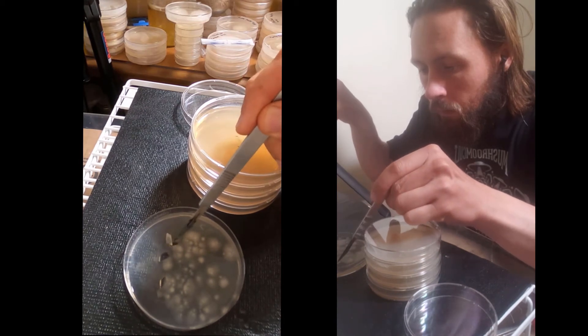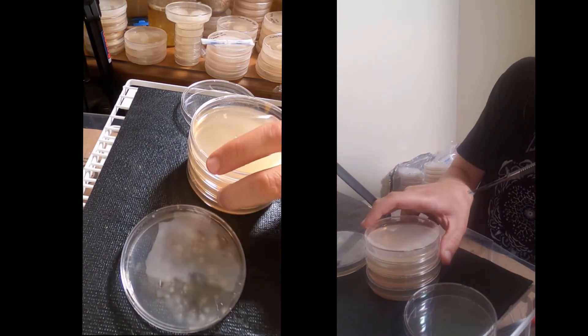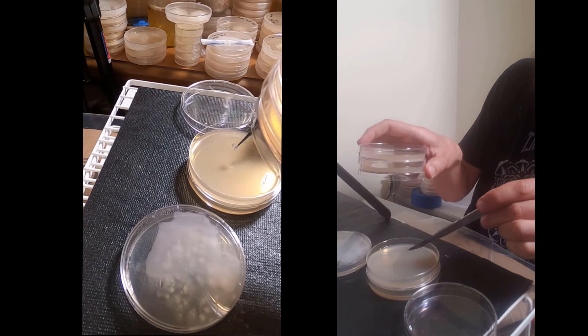In theory I would be able to isolate something from each one of those colonies, but I'm really just going for a handful of the easiest pieces and I'm putting it right in the center.